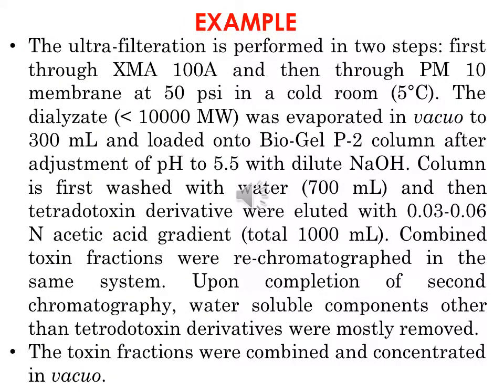With respect to irreversible adsorption, there seems to be a strong relationship between the shape of the molecule and the pore size of the chromatographic supports. For example, linear polycyclic ether toxins are easily trapped in silica gel 60 and never eluted even after washing with very polar solvents. The utilization of large pore silica gel can lessen this irreversible adsorption, but it also results in poor separation.